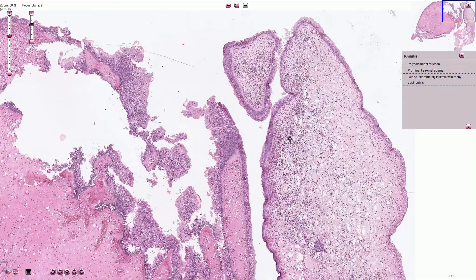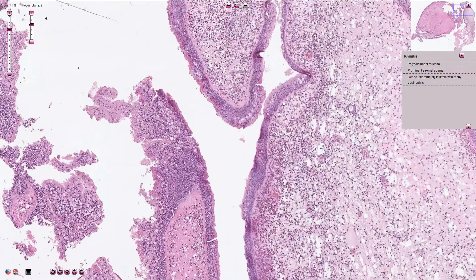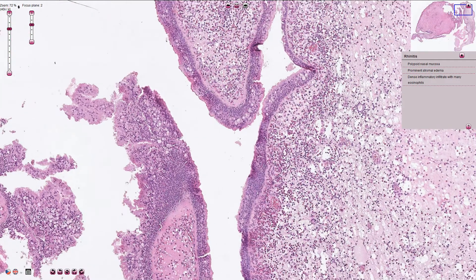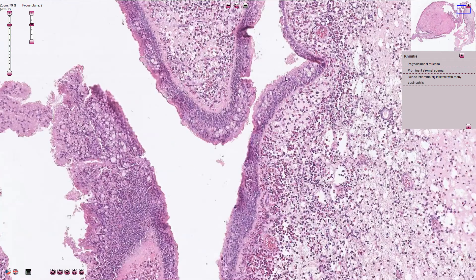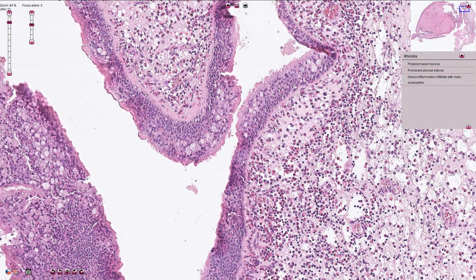On higher magnification we can see that the mucosa is lined by pseudostratified epithelium of respiratory type, which consists of basal cells, ciliated cells, and goblet cells. It looks like stratified columnar epithelium; however, all the cells are connected to the basement membrane, so we call this pseudostratified respiratory type of epithelium.